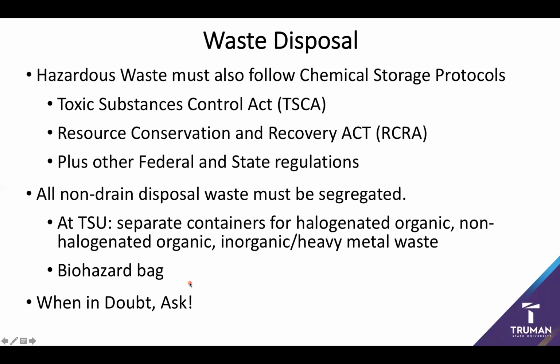It never hurts to ask to see exactly where it goes, especially in case you encounter a possible reactivity issue. Because again, there's a lot of possible chemical reactivity out there, and while doing your research before you start a procedure is always recommended, you may miss something, so never be afraid to ask.